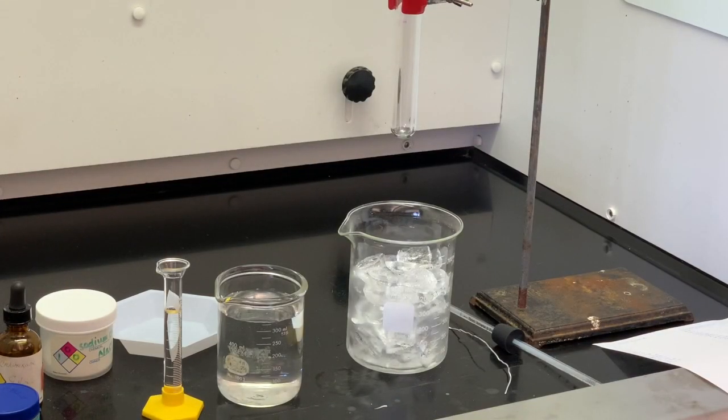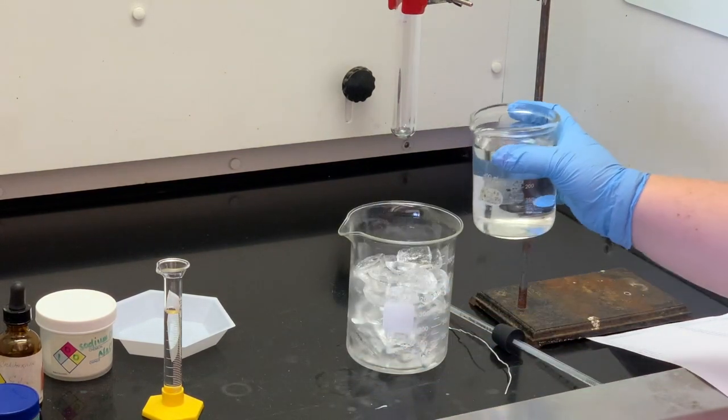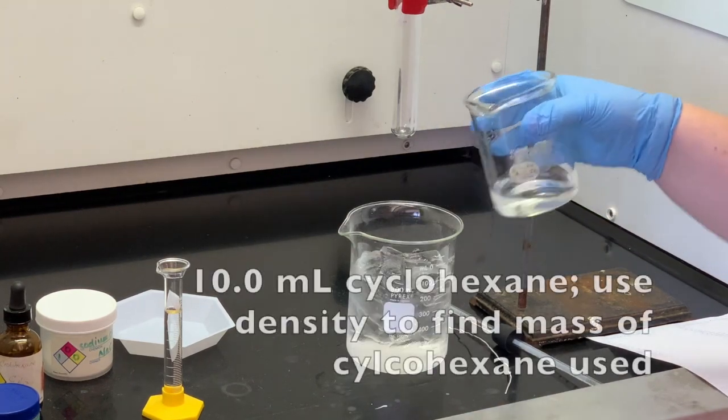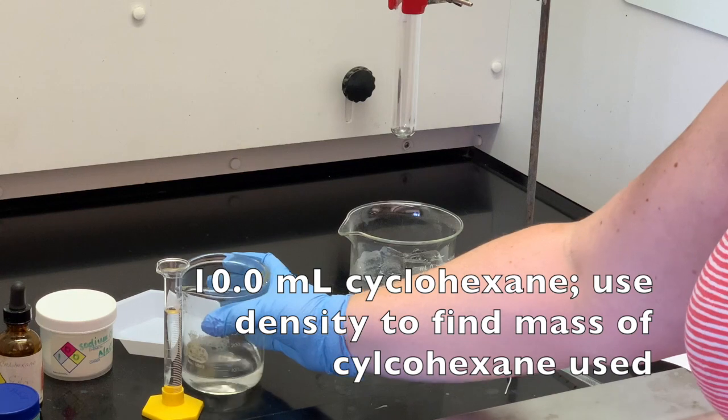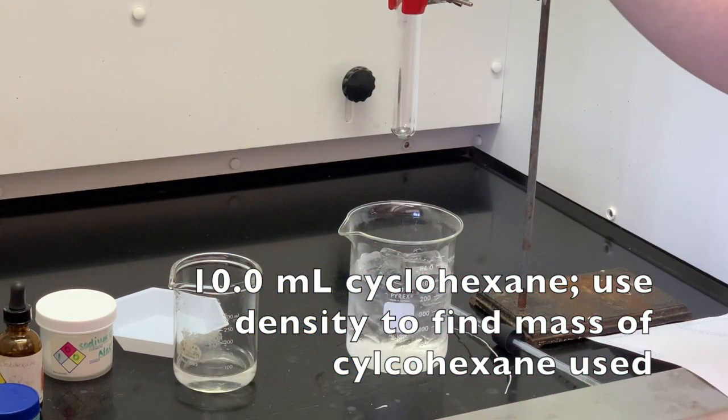I have dissolved the sodium chloride in the water, so I'm going to pour that into my ice bath made in this 800 milliliter beaker. I've also measured out 10.0 milliliters of the cyclohexane. I'm going to put that into my nested test tubes here.